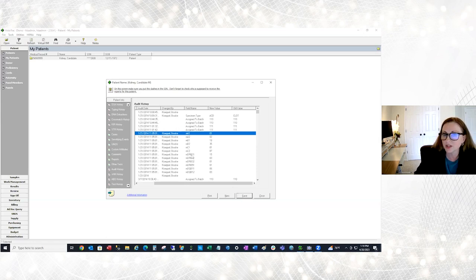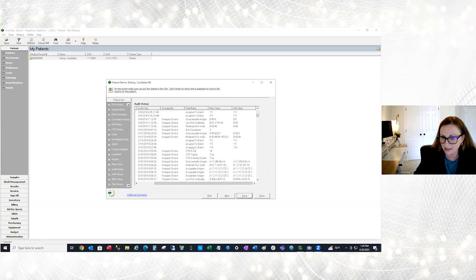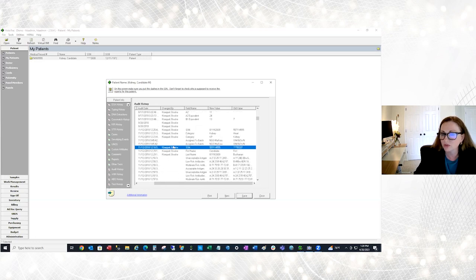So this is usually a good place to go back and try to figure it out. If somebody had changed the medical record number, you'd be able to come back here and maybe try to figure out why they did, and have a source to go to, to potentially troubleshoot. Like in this example here, I changed the social. So why did I do that?